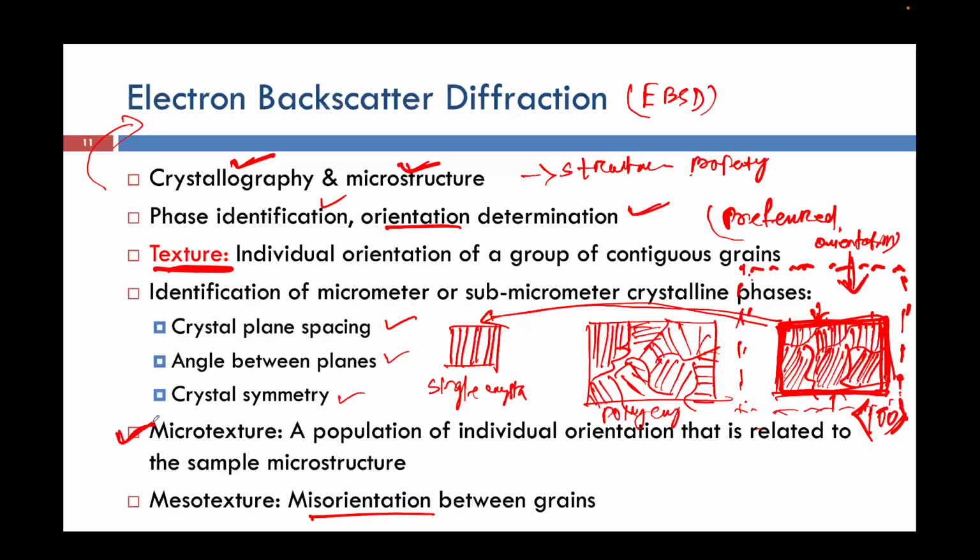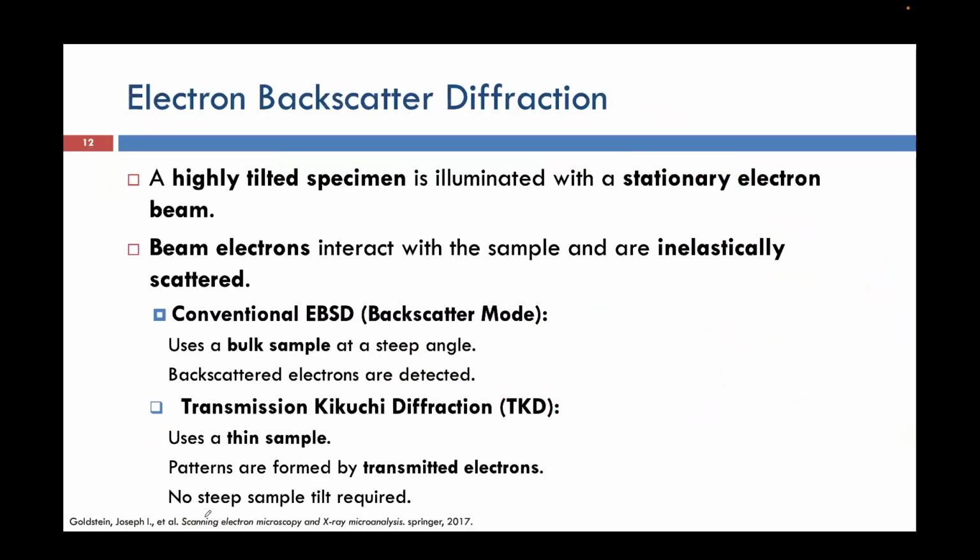Okay, and then there is another term called mesotexture, that is, the misorientation between the grains is termed mesotexture. So these are some of the terms used with EBSD.